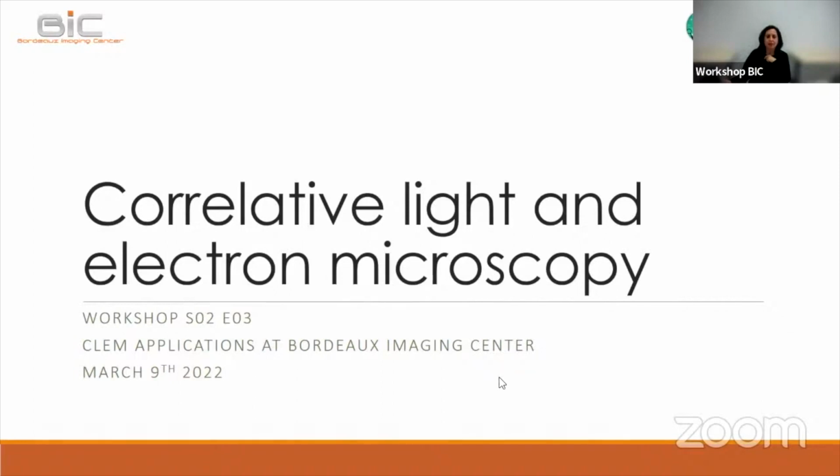So I'm really happy to be here with you in this last episode of our series of workshops dedicated to protein localization in high resolution. This is our last episode, and we will be talking about correlative light and electron microscopy.